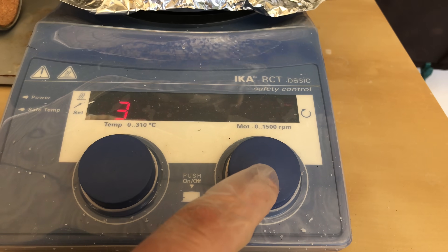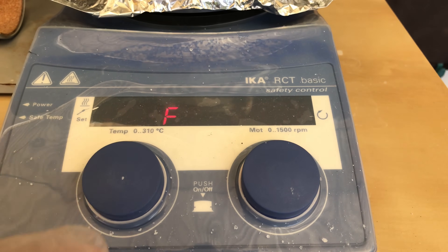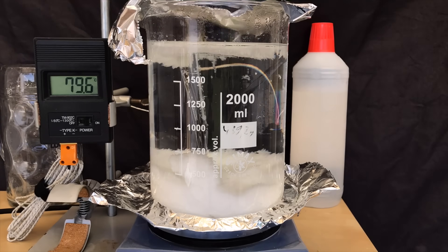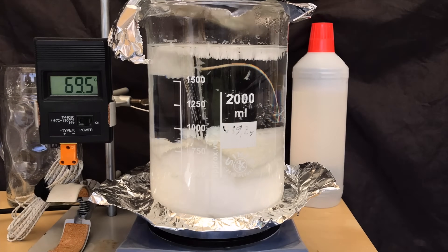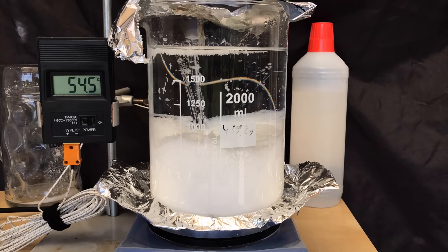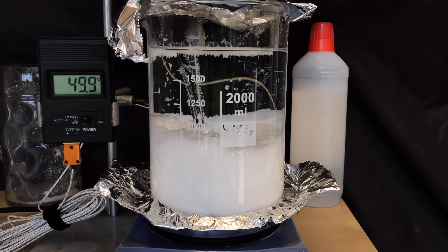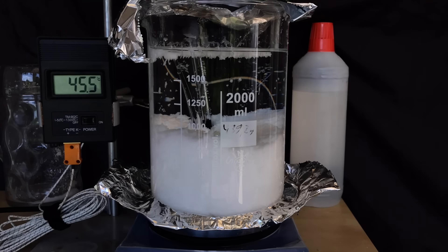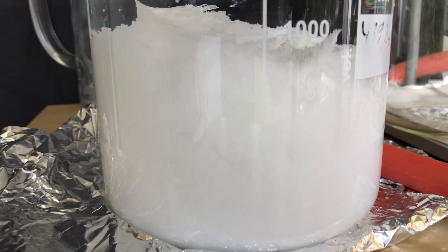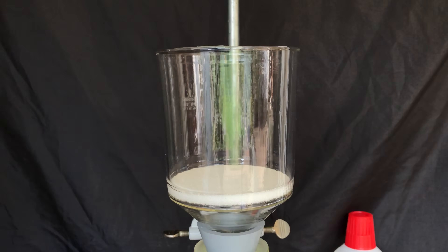The moment the solution was clear, heating and stirring were turned off and we only had to wait for crystals to form. This timelapse was filmed over the course of about 4 hours. The crystal mass didn't increase but because the crystals are bigger there's more water between them, so it looks like we got more potassium bromate than we started with. Once the solution reached about 25 degrees Celsius most of the potassium bromate had crystallized out.